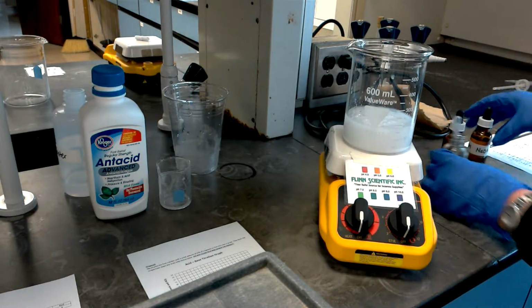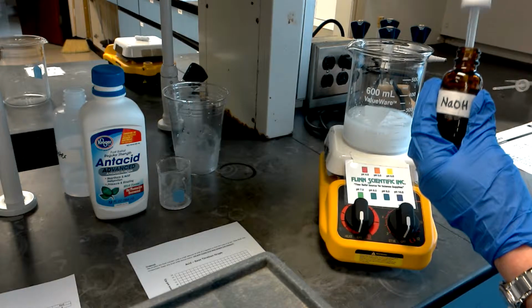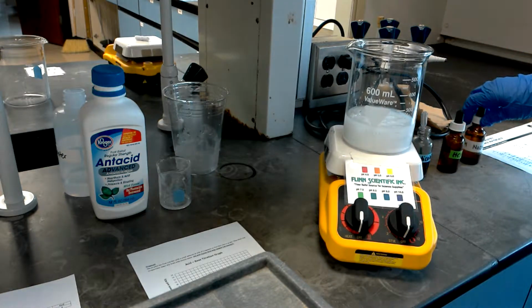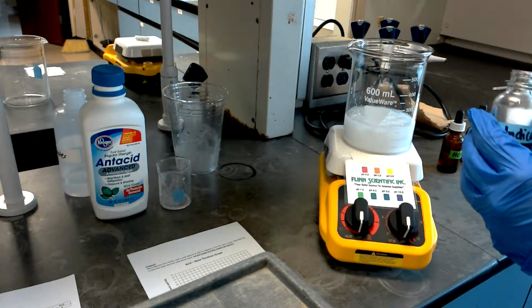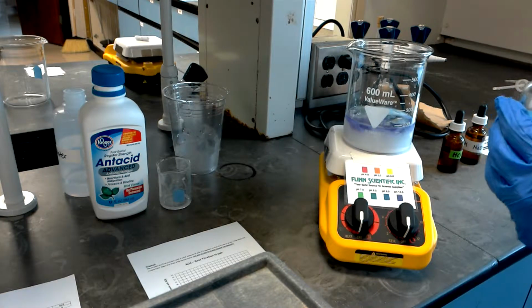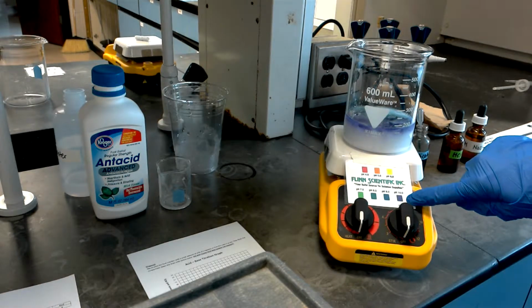It asks you to put 2 pipettes of sodium hydroxide as well in here to help make sure that you have some good hydroxide ions in there, because it's a strong base, so it's going to dissociate. And then a couple of pipettes of indicator solution. You're going to start off with a basic solution, so it makes sense that it is a purple color, because purple is the color of a pH of 10.